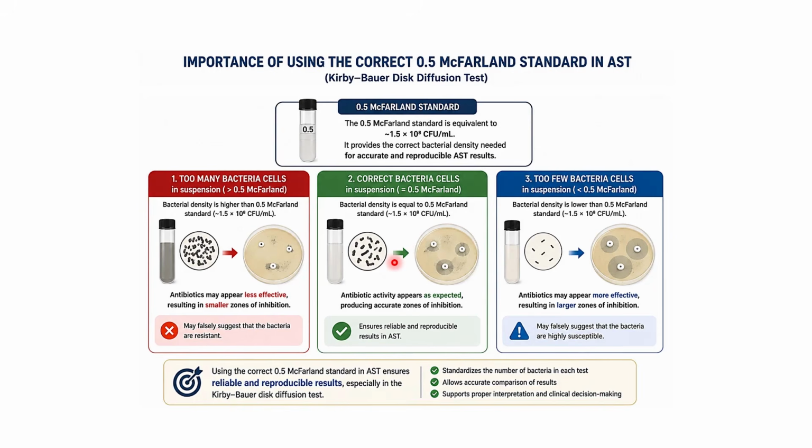So standardizing the bacterial suspension to the recommended turbidity will always ensure that the test starts with approximately the same number of bacterial cells as that of the 0.5 McFarland standard. And as a result, this produces a more accurate and reliable antibiotic susceptibility result, particularly in the Kirby-Bauer disc diffusion test, to allow results to be compared confidently between laboratories.